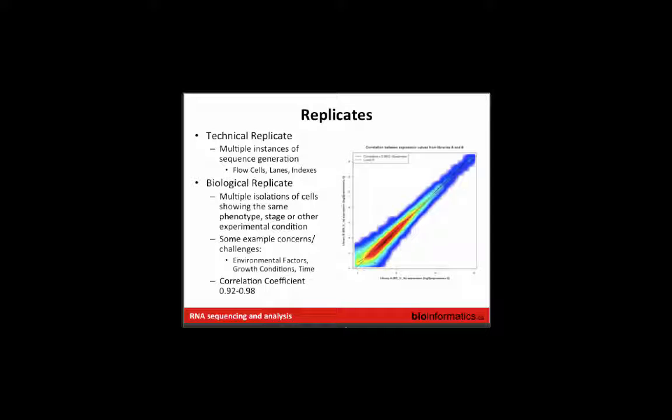I mean, especially depending on what question you're asking. So if you have one of the applications that places high demands on good coverage and even representation across the transcriptome, say alternative splicing, where you want to understand the ratio between isoform A and isoform B that differ in the connections of exons, if you're not getting good representation of the coverage of those exon-exon connections in one of your samples, you're not going to be able to rescue that. The information is simply maybe missing or lost.